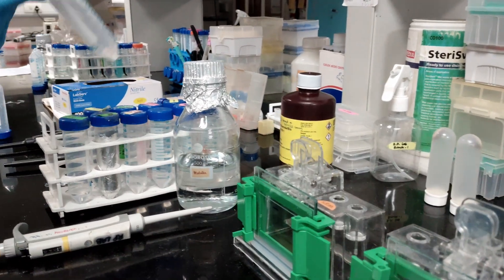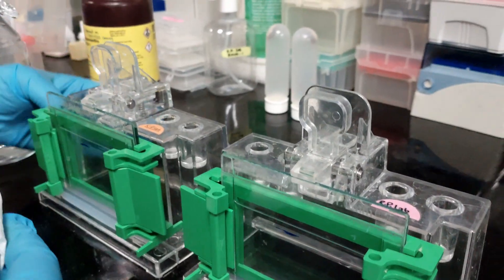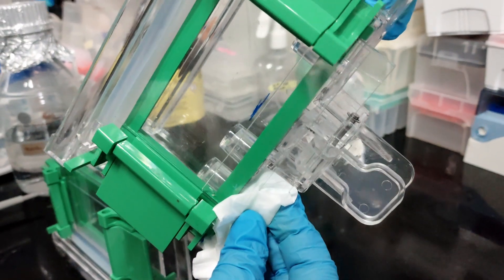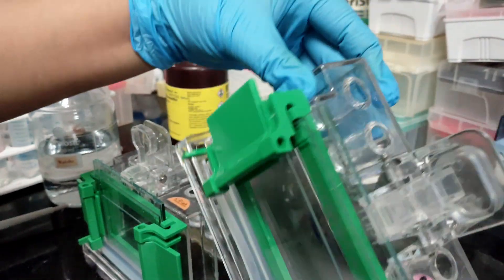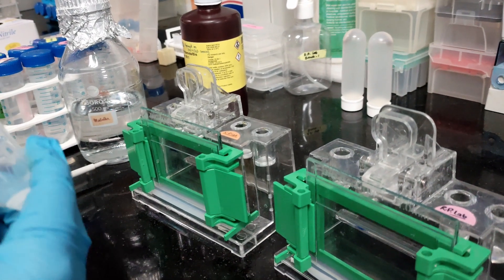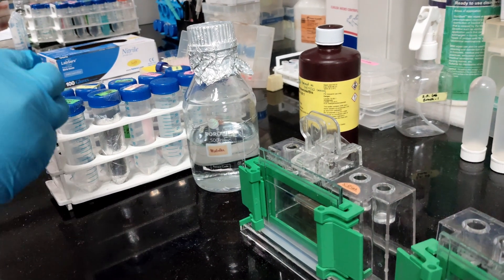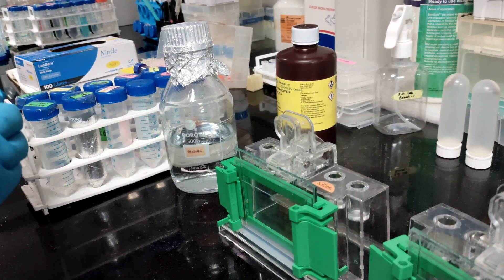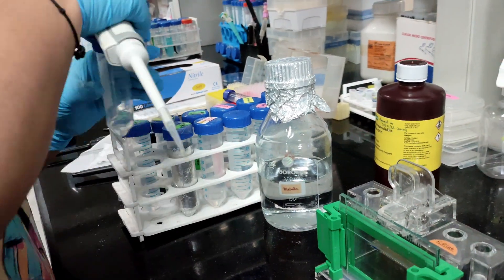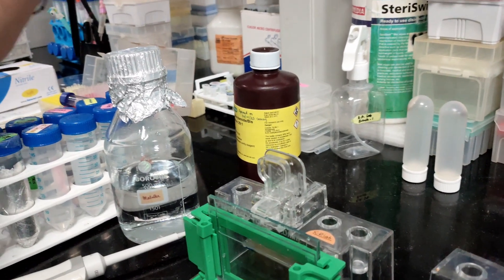Our resolving gel has already set — we can check that by looking at the remaining buffer in the falcon tube. Now we will remove the isopropanol from the top using a kimwipe. Make sure no isopropanol is left behind; dab it gently in the corner. Now we are going to pour the stacking gel. I have already prepared the stacking gel — only the TEMED addition is left, which I'm going to do now. For 2 gels I have made about 4 ml of stacking buffer, and I am adding 10 microliters of TEMED.